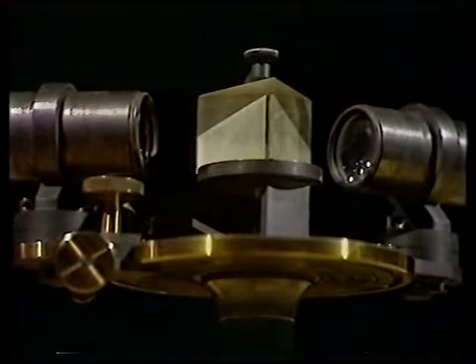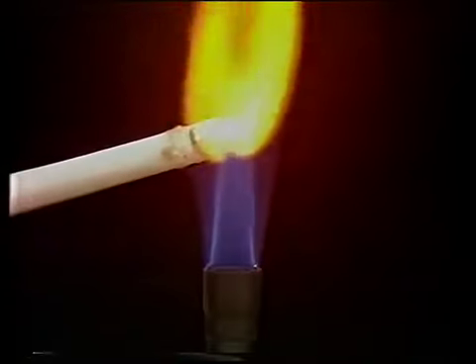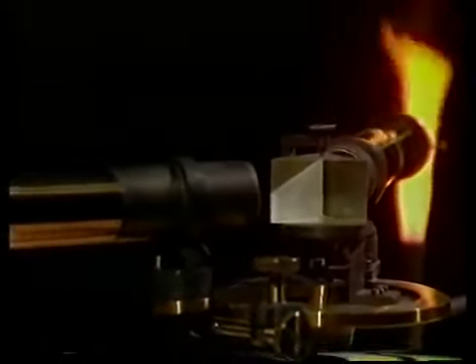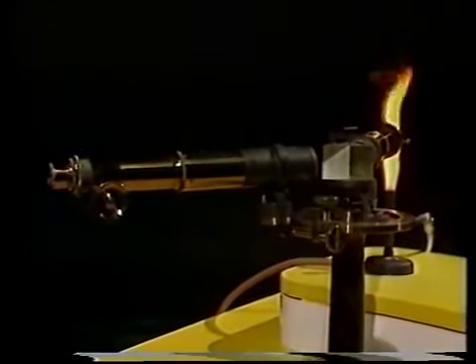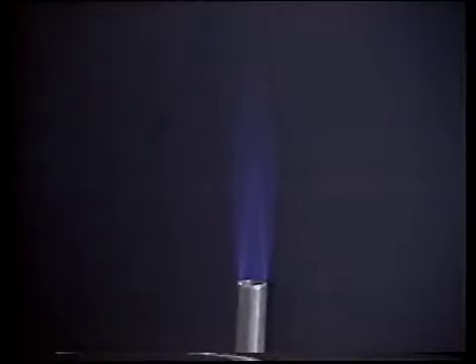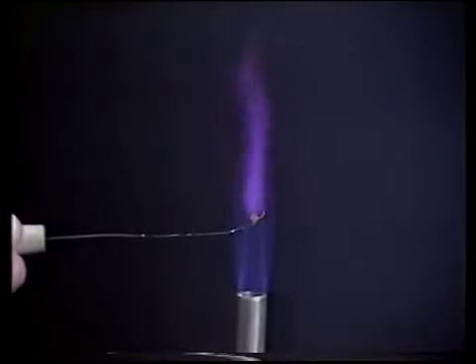Before I finish, I'd like to show you how this all began with the invention of two devices: the spectroscope and the Bunsen burner. Introduce a salt into the flame of the burner and examine the light through a spectroscope. This was how two German scientists, Kirchhoff and Bunsen, carried out the first experiments in atomic spectroscopy. One of the salts they looked at was this. In this blue flame, they discovered something startling.